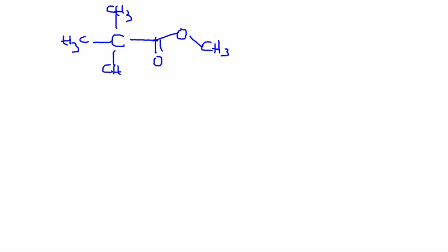For example, and we are going to, of course, spend the time through the PowerPoint as well. But let's say I had an ester. So I have CH3 over here, and 3 CH3s over here. And somebody asks you, what do you predict in the NMR of this particular compound?